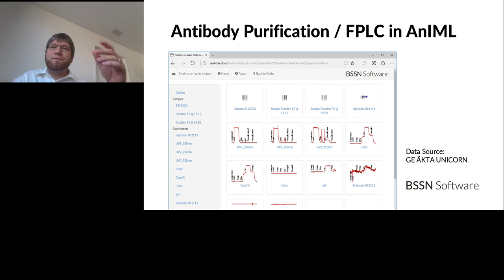And this is the same software, right, that we used to look at a chromatogram, at spectra, at plate reader data, and so on. So that's the power of the standard, where I really see us making a big jump towards this lab of the future idea, that I get to look at the data from all of the different experiments that I do around my samples and consume that on the same platform.